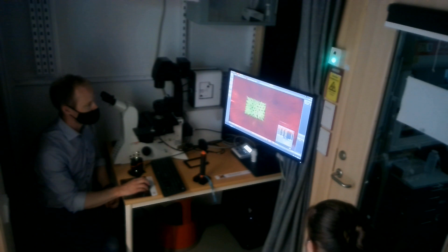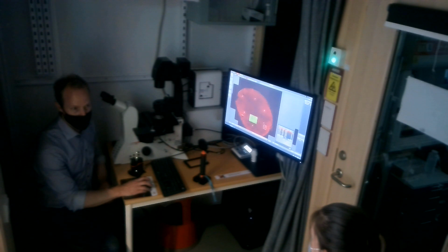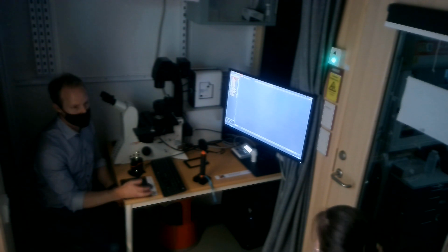It's not stitched or anything, because in this interface, the images that we see here will never be stitched. They will never be perfectly aligned. So if we want to see the result, we have to go into mosaic merge. The mosaic merge is the viewer of Navigator.